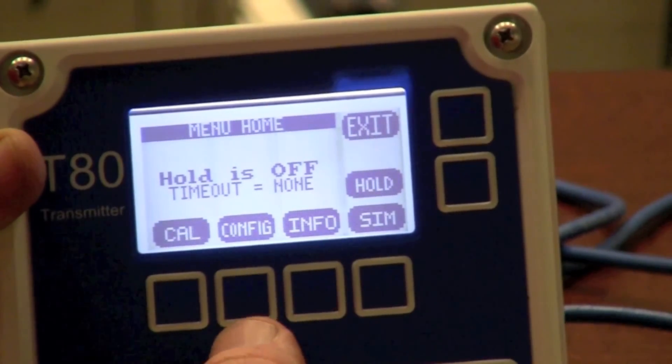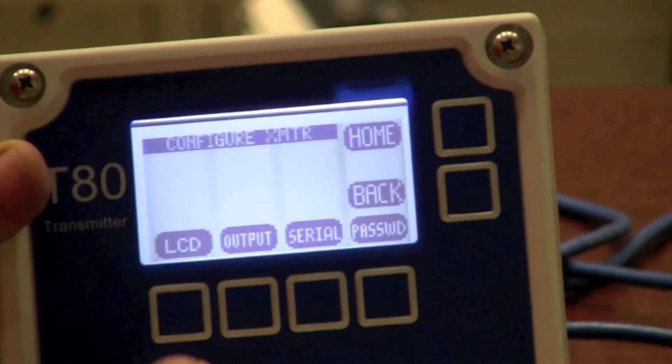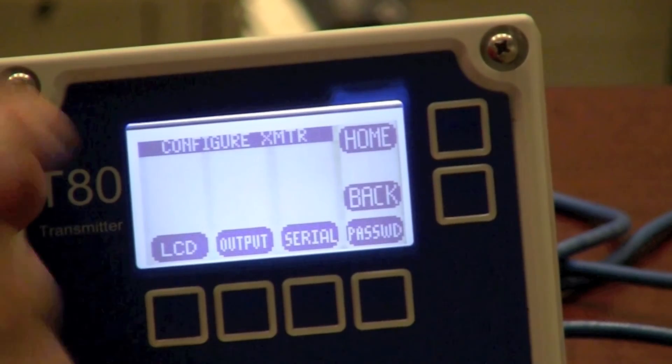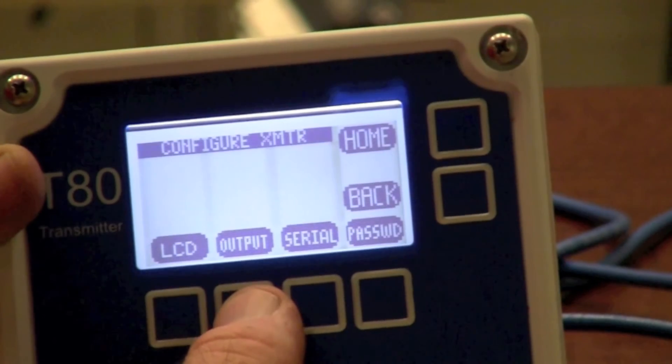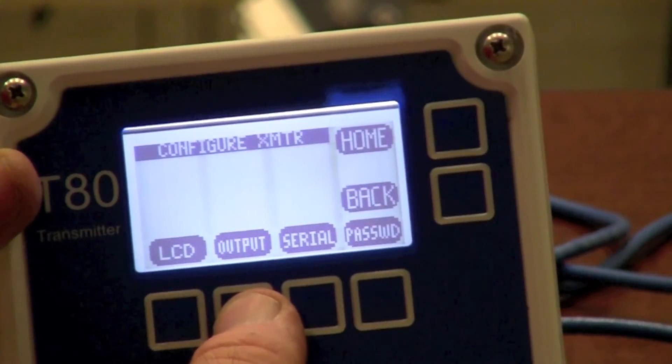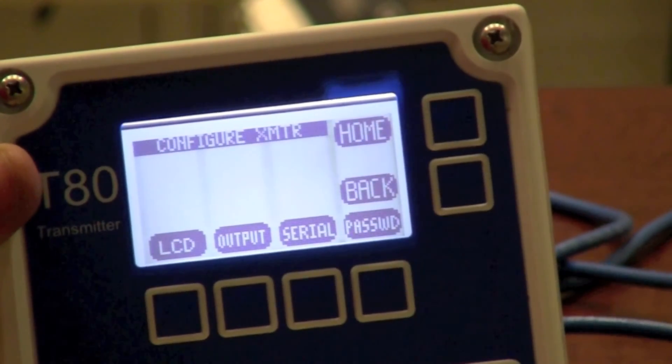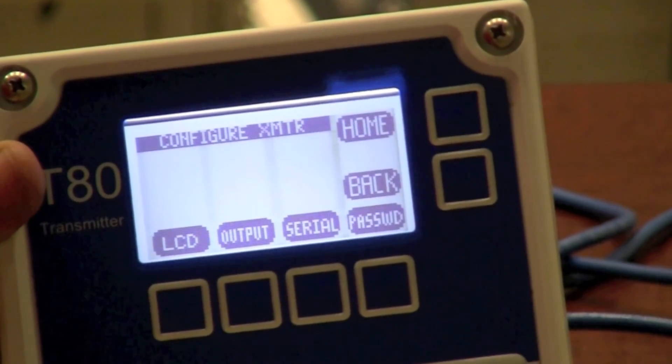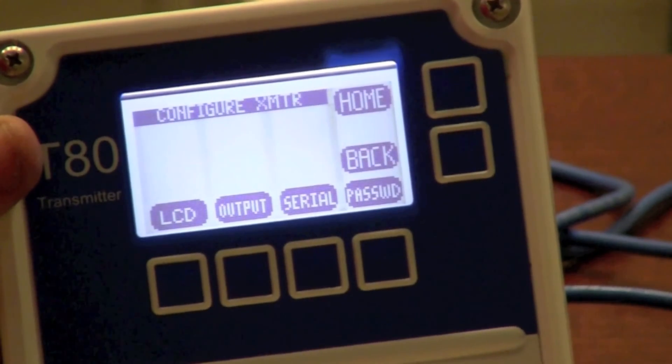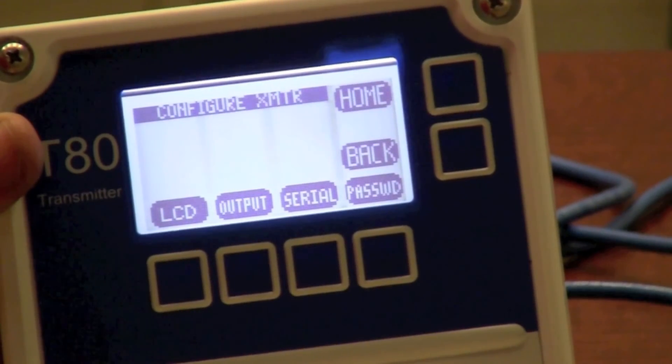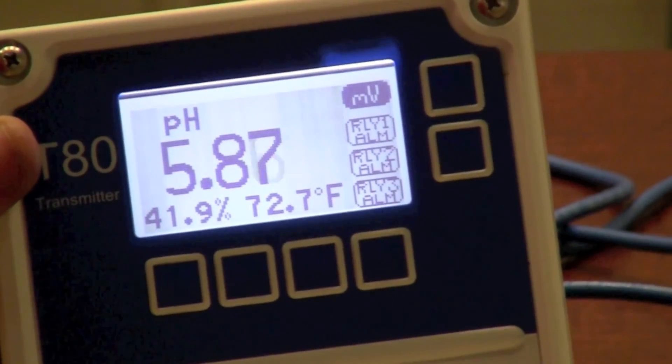Another nice feature is the ability of configuring the transmitter. I can adjust the LCD display. I can adjust the output so that I get the 4 to 20 over the desired range. I can also adjust the serial settings. This unit has a 4 to 20 milliamp output as standard. It has a second 4 to 20 milliamp output as an option. That second 4 to 20 milliamp can be assigned to temperature if a single probe is used. This unit is also available in a dual channel.